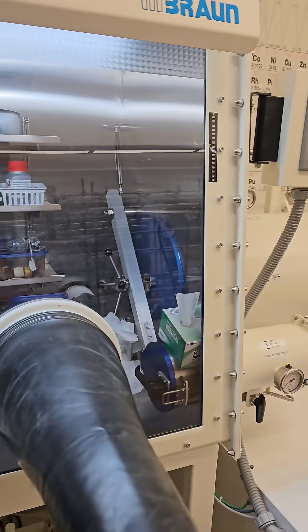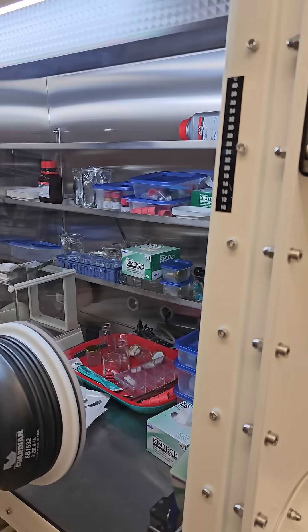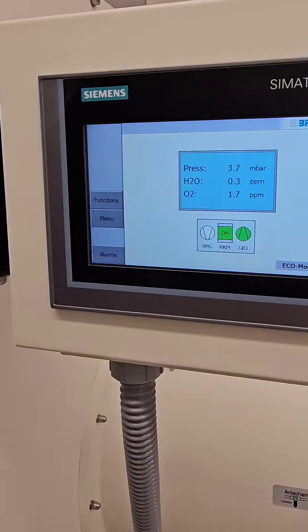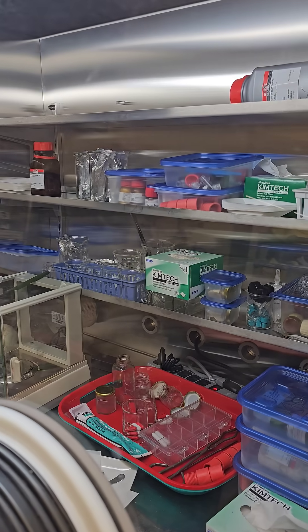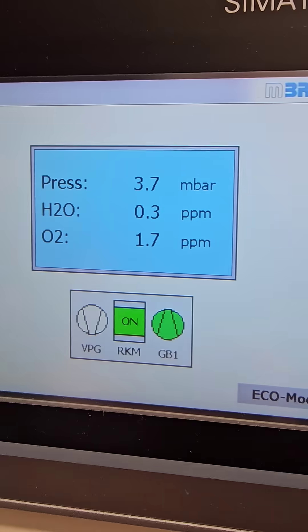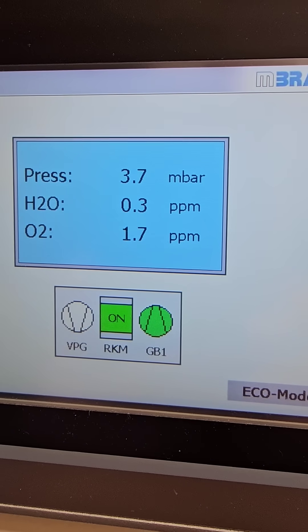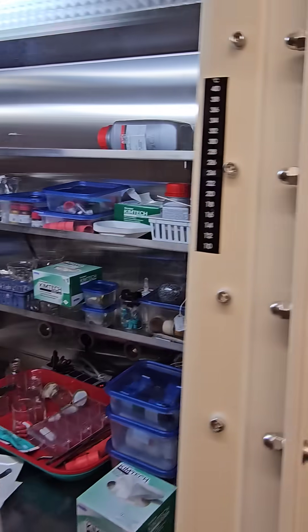One of the pieces of equipment that's absolutely critical for my research is our glove box, which allows me to work in an atmosphere of ultra-pure argon. Here we're at 0.3 ppm water, 0.17 ppm oxygen, which is a little bit high.